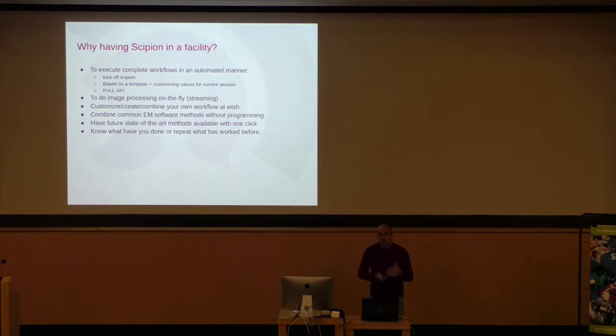Obviously, if you have a template, you need to customize some values because not every session is the same. Magnification, dose, whatever, box size maybe. So you need to customize that template. And there are ways to do it in Scipion.